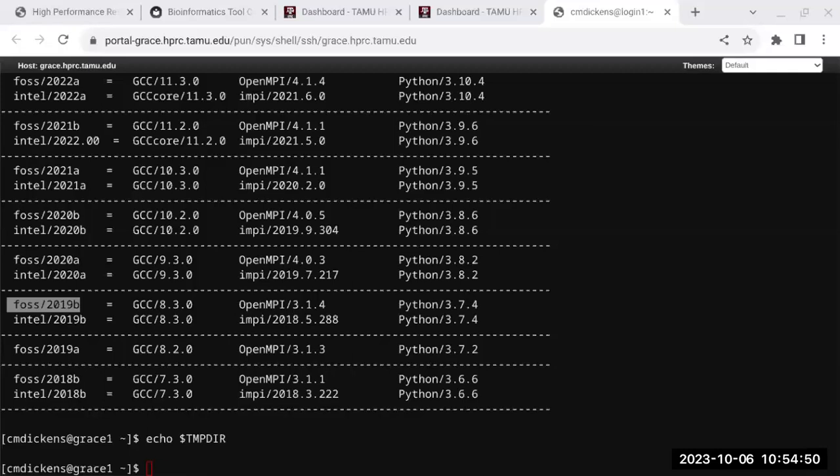All right, template job scripts. We'll go over this section, then we'll take a break. So we have a lot of template scripts. These were developed as we installed software. We tested them. We have some example test data. And basically we create a job script that you can use as a template.